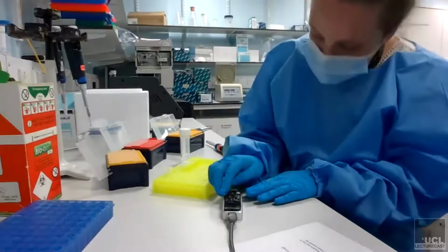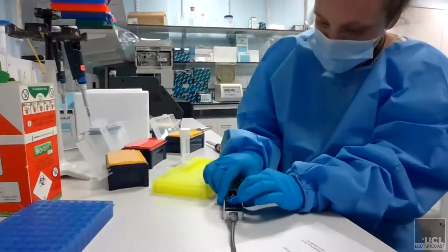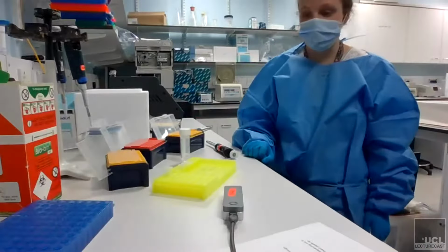So then all you need to do is put the covers back, close them, and then you can start on the computer. So yeah.